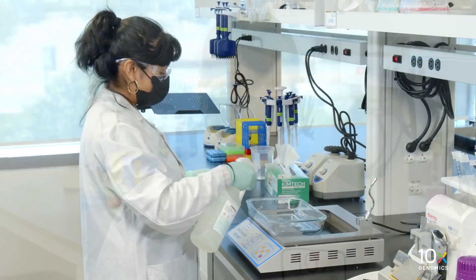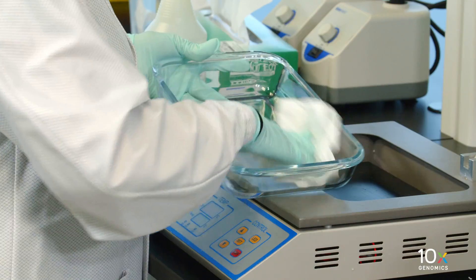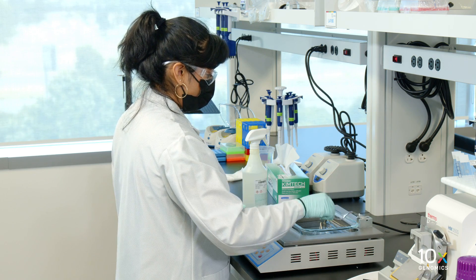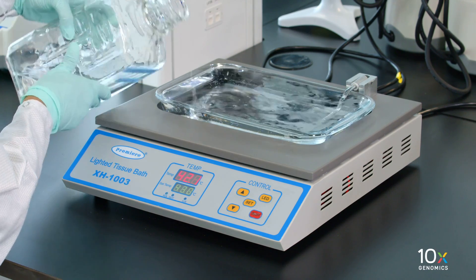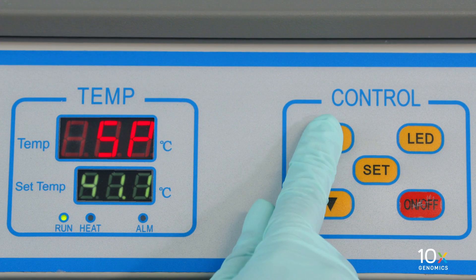We are preparing to collect the tissue sections. First, we will prepare a water bath. Clean with RNA-SAway before using. Fill the water bath to the brim with Millicu or Ultrapure water. Set the water bath temperature to 42 degrees Celsius and let it stand for at least 30 minutes.